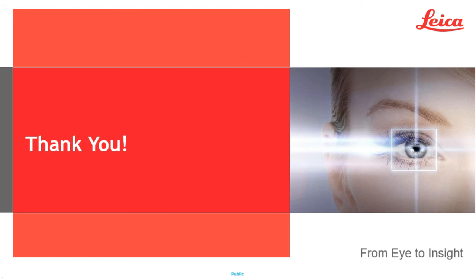For the machine learning, I'm talking about that video where we're painting and training. You can see that most of the time the machine learning doesn't require as much data, since it's just providing select regions of what the objects look like. For the deep learning, it depends on what you're doing and what it is that you're looking for.